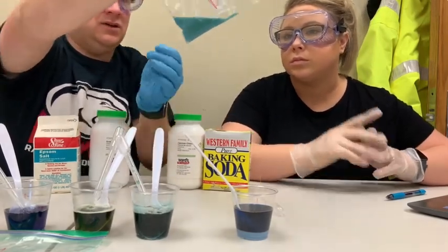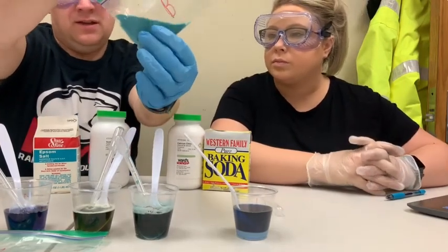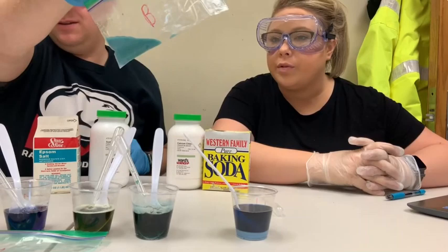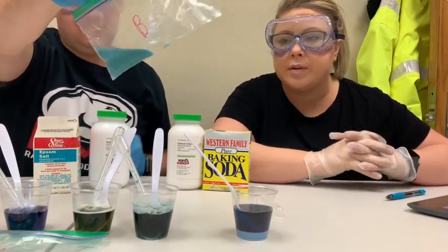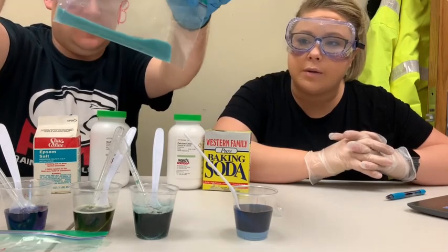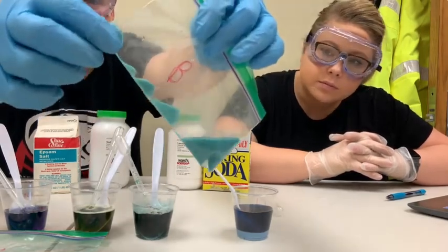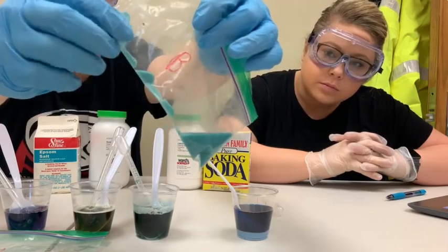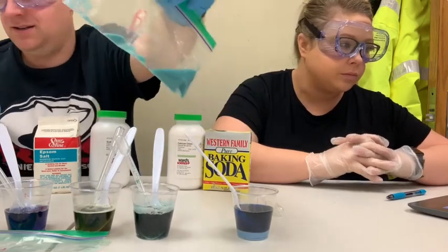Well, I don't feel much of a temperature change. I think it's just a little warm because it was warm from the first experiment. But no bubbles, so there's no gas being produced. But we do have a little bit of a precipitate forming as it's getting a little cloudy. Yeah, you can see some of it here in the corner, some of these grains. I can kind of pinch it, and then you can really see that there's some solid material left behind.